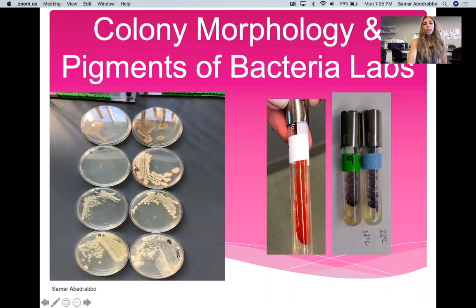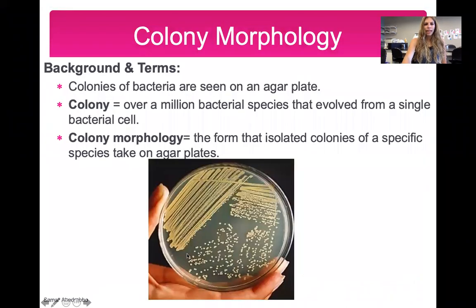And then the other portion of the lab is the pigments of bacteria lab. Some bacteria produce different specific colors or pigments that distinguish them from other bacteria, and that's what we're going to talk about. I'm going to start off with the colony morphology lab.